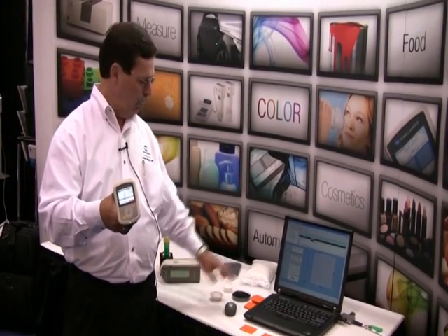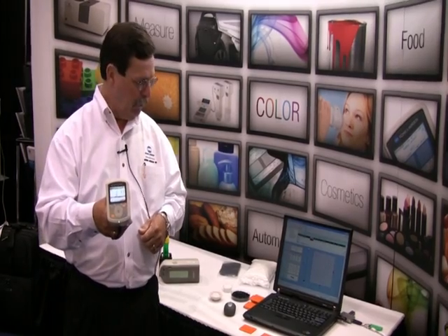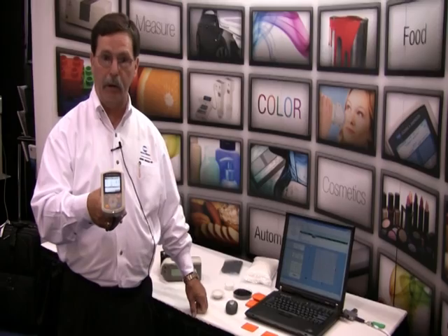Some of the different kinds of applications we can measure: flat samples, curved samples, powders, and pellets with the instrument. The instrument is very durable. It gives you portability as well as excellent inter-instrument agreement and great reproducibility.